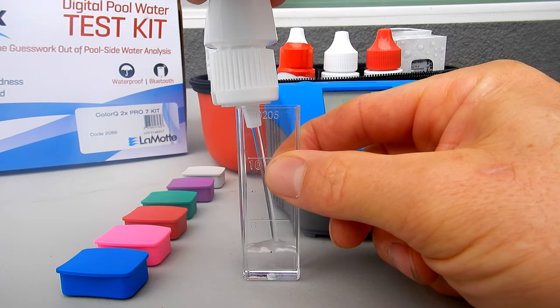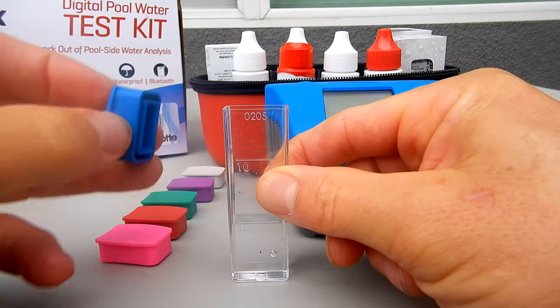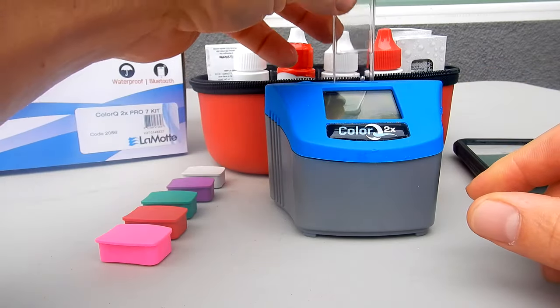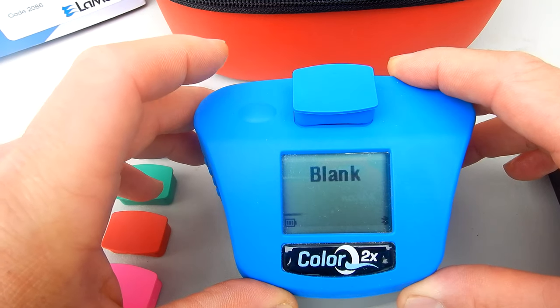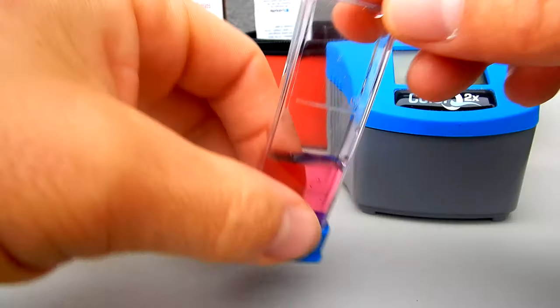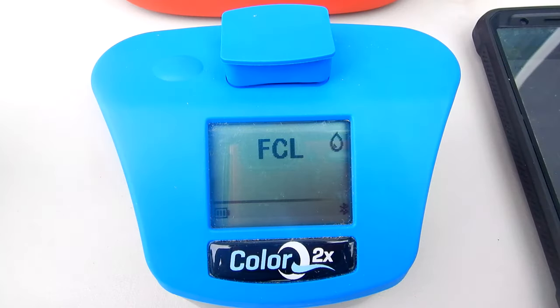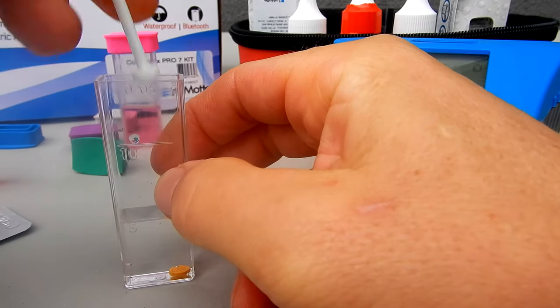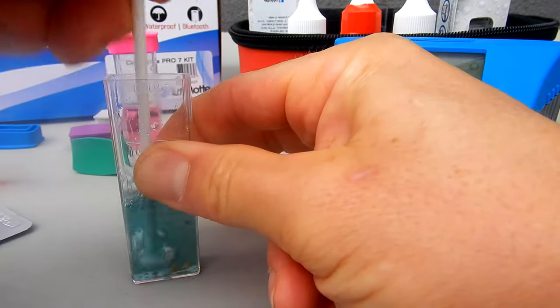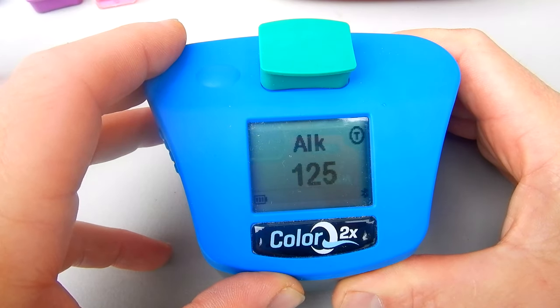You would simply fill each tube to the 5 ml mark with the sample water, then blank out the unit before your first test. Now you can add the reagent to do the test for free chlorine, total chlorine, or bromine, and also the pH. Then you would use a tablet to do the test for the alkalinity, calcium hardness, and cyanuric acid. It's a very simple and easy digital water tester.